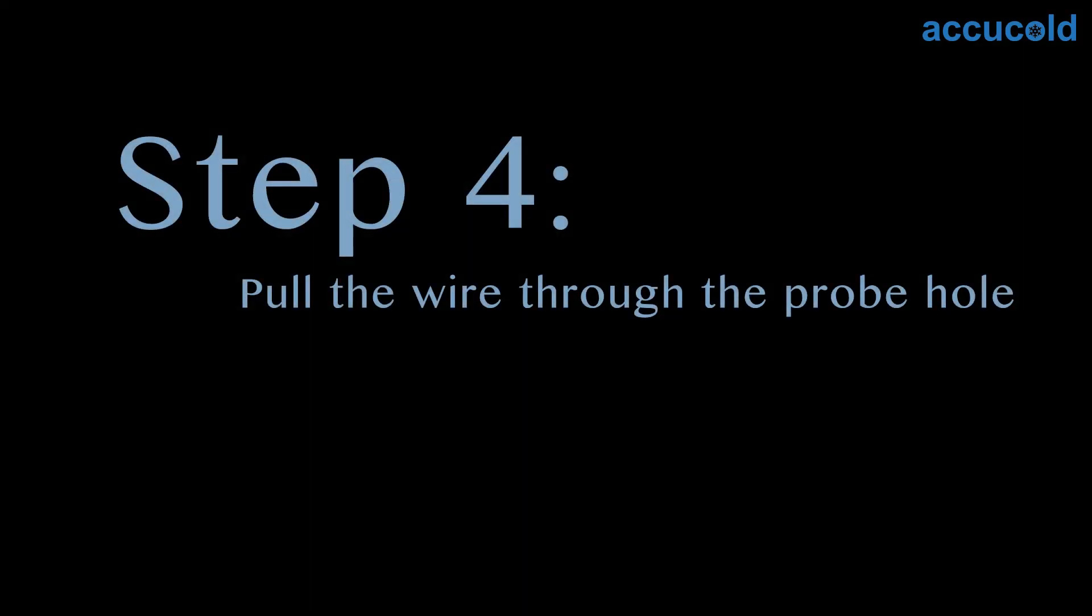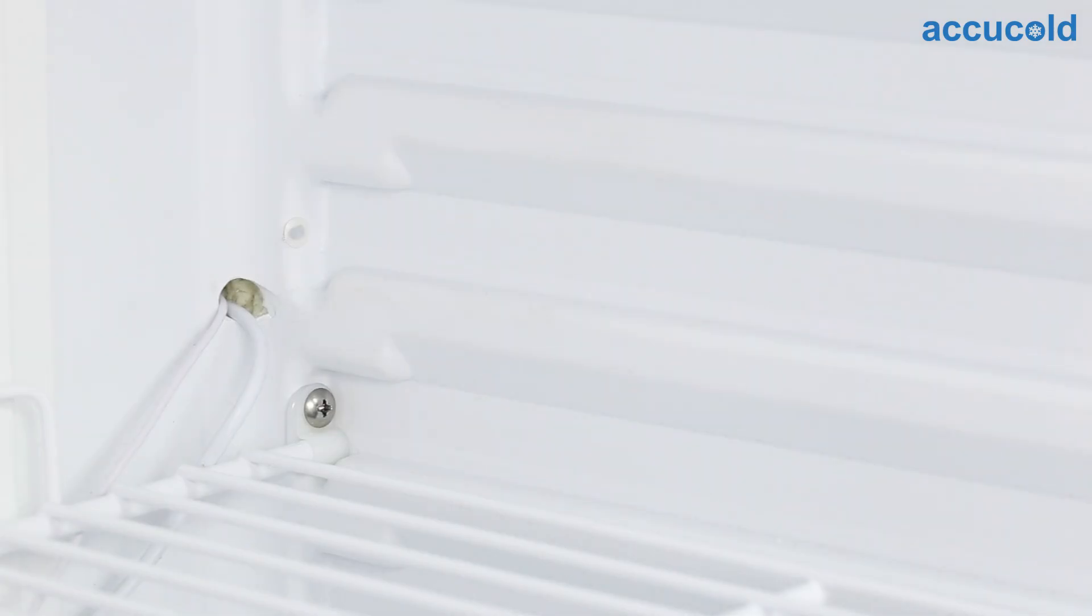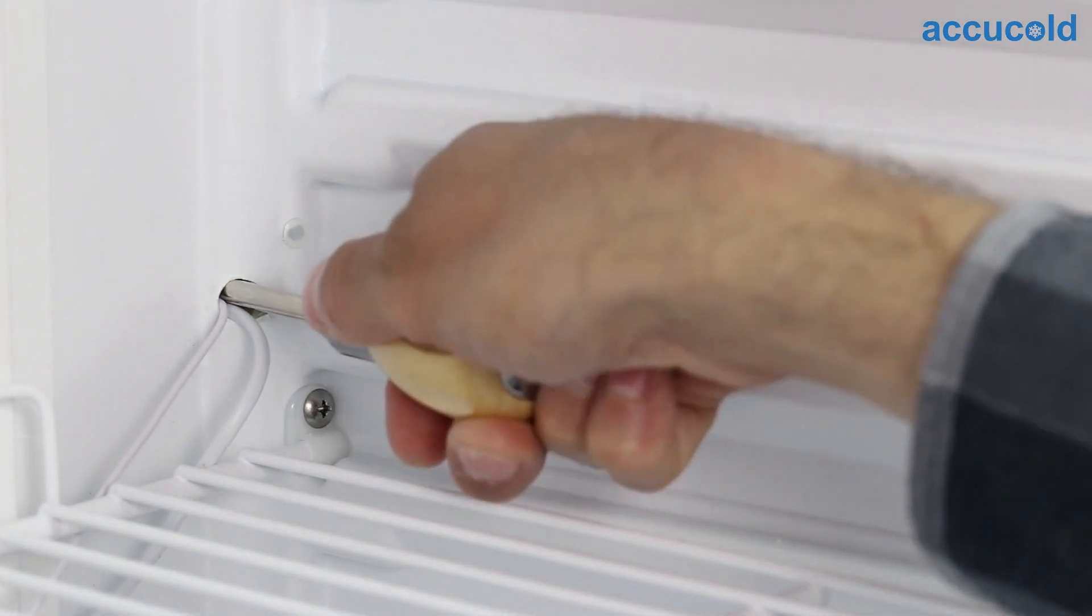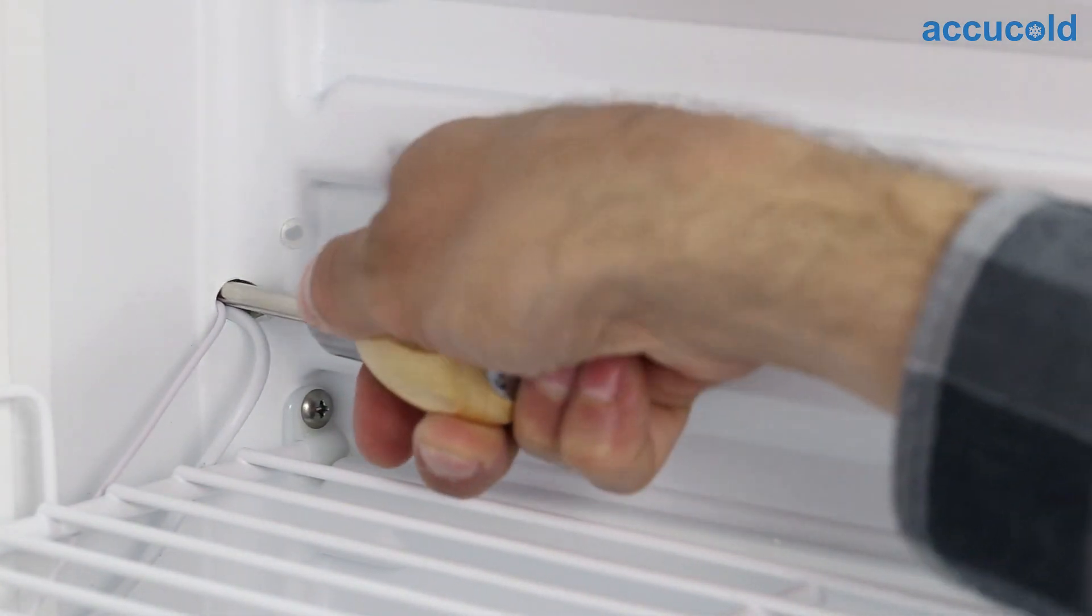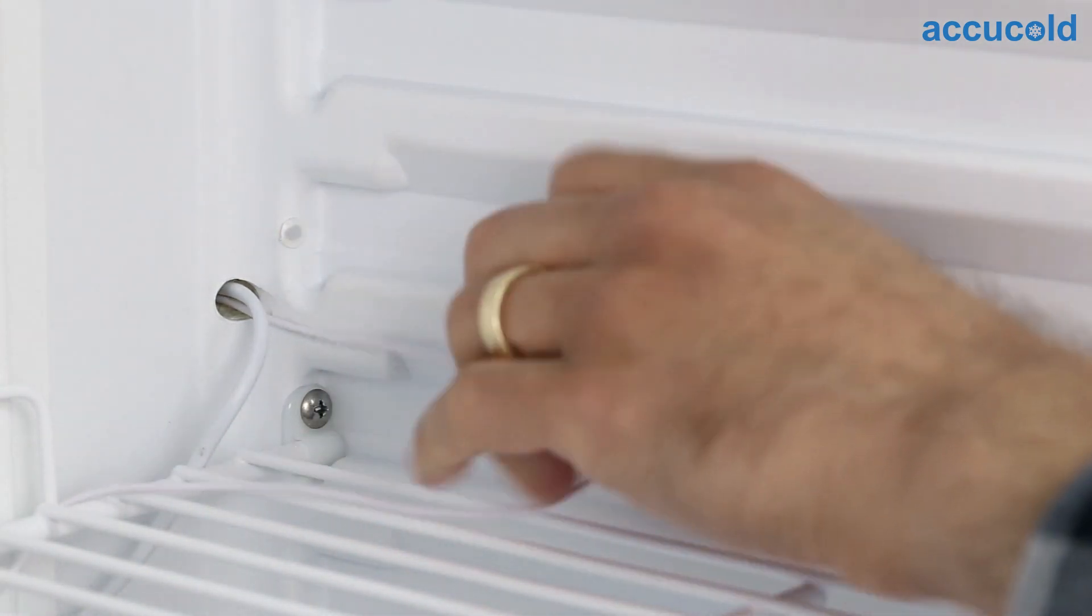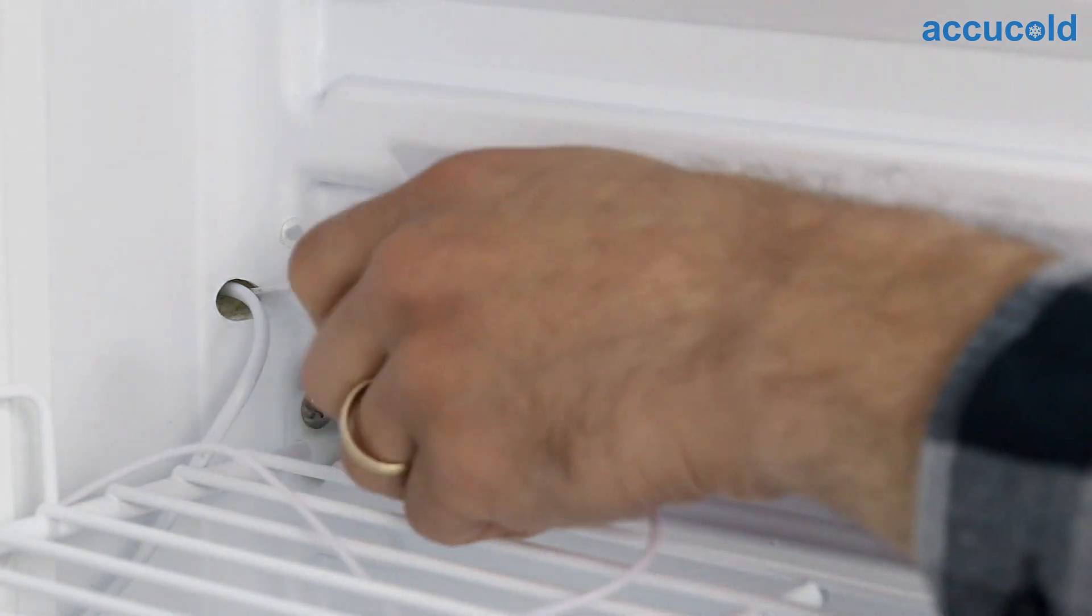Step four, pull the wire through the probe hole. Locate the hole inside the appliance that allows the probe wire to pass through to the back side of the unit. Using a straight pick, puncture the seal that secures the wire into the hole. Pull the wire through the hole, freeing the probe and wire from the appliance.